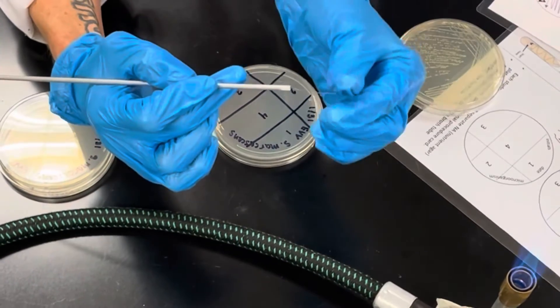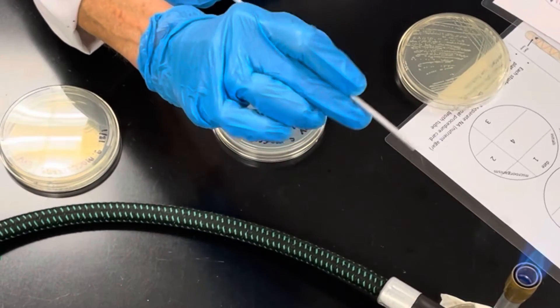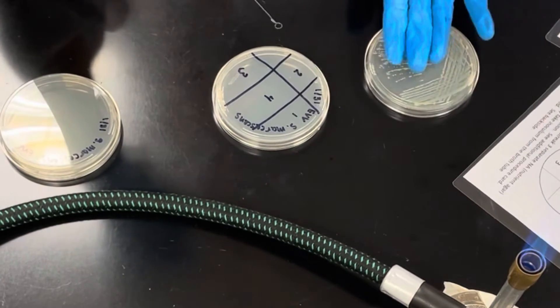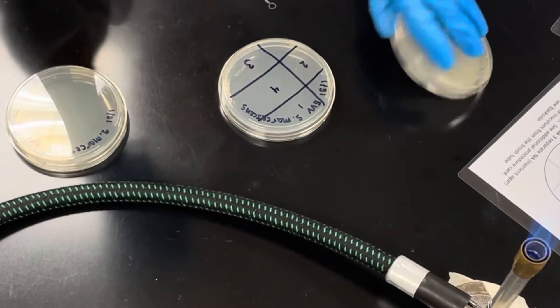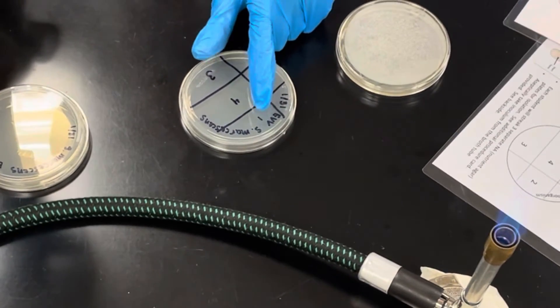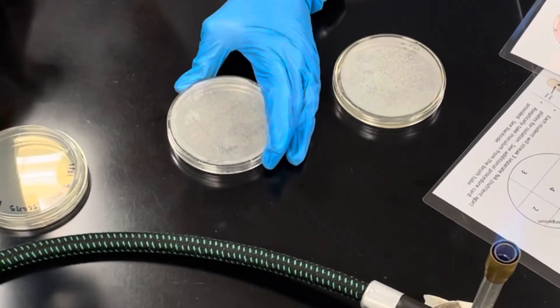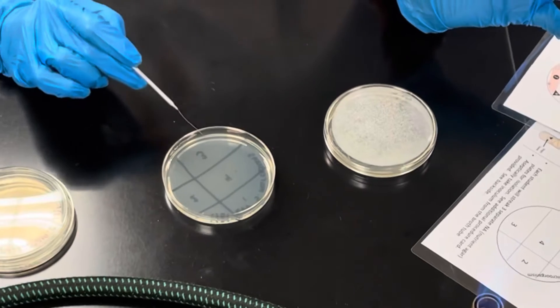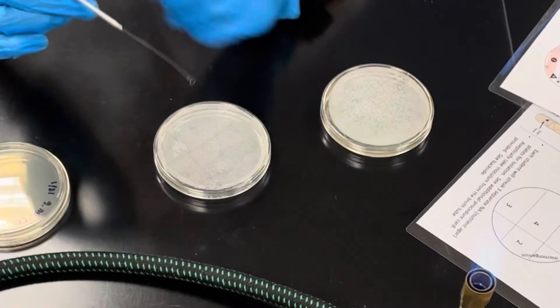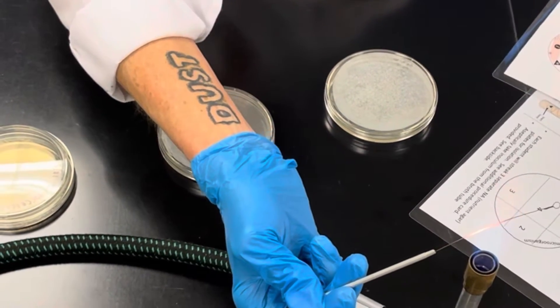Take your inoculating loop and incinerate it using the hottest part of the flame at the tip of the inner blue cone. Today we're going from a plate to a plate. Flip your plate over — you want quadrant one at the top. You want to flame from the base to the tip until it glows orange all the way to the loop.